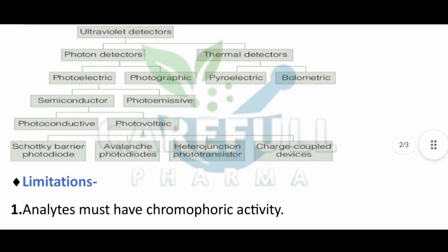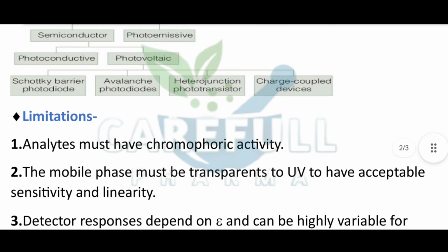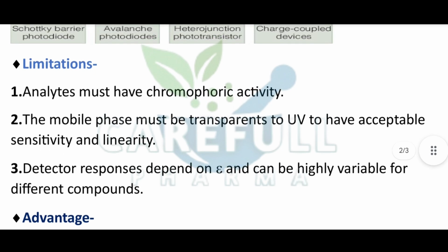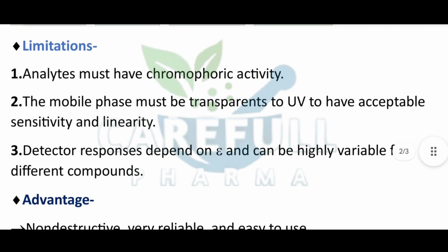Limitations. 1. Analytes must have chromophoric activity. 2. The mobile phase must be transparent to UV to have acceptable sensitivity and linearity. 3. Detector responses depend on ε and can be highly variable for different compounds.